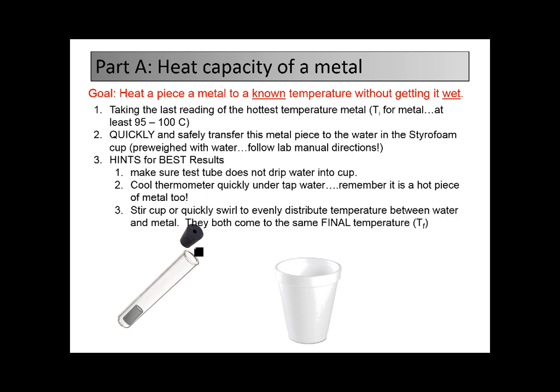Then you're going to quickly remove the stopper and quickly transfer that piece of metal into a styrofoam cup that has water in it. You don't want to splash the water out, and you don't want any water from the test tube to drip in there because water has a high heat capacity. So keep that dry. You also want to use the thermometer to measure the temperature here, but you're only going to get one thermometer, so you need to cool that thermometer off first — you can do it quickly by running it under some tap water. Because if you put a hot thermometer in to measure the temperature, it will actually raise the temperature and ruin your experiment. Cool your thermometer back down before you use it in here.